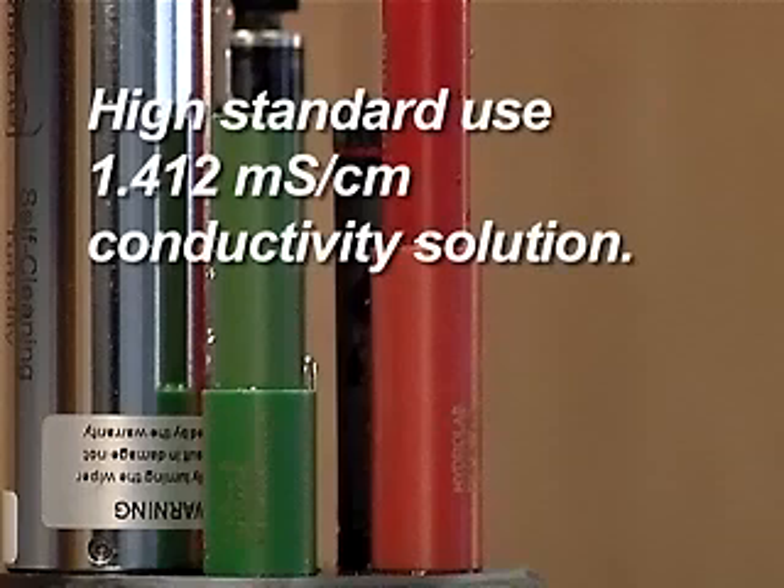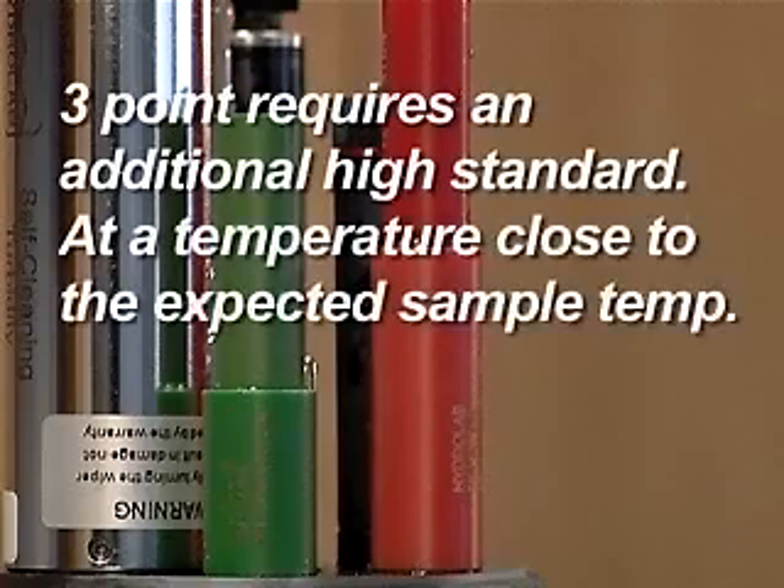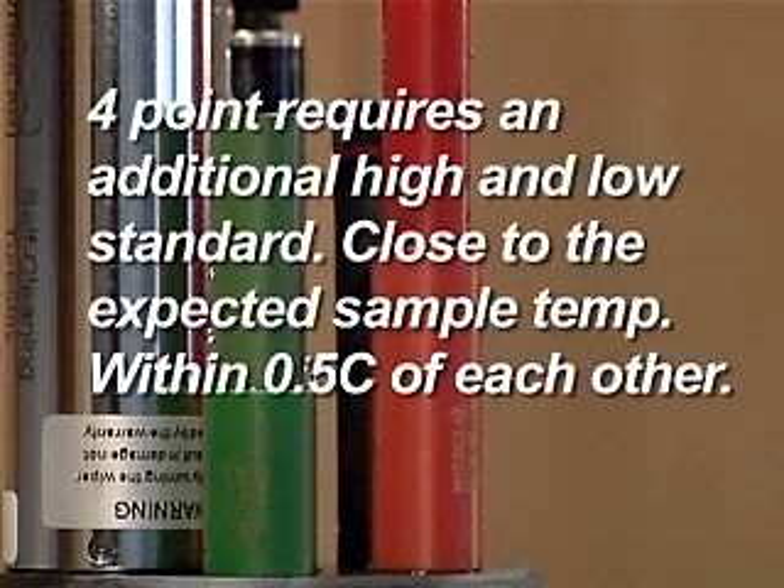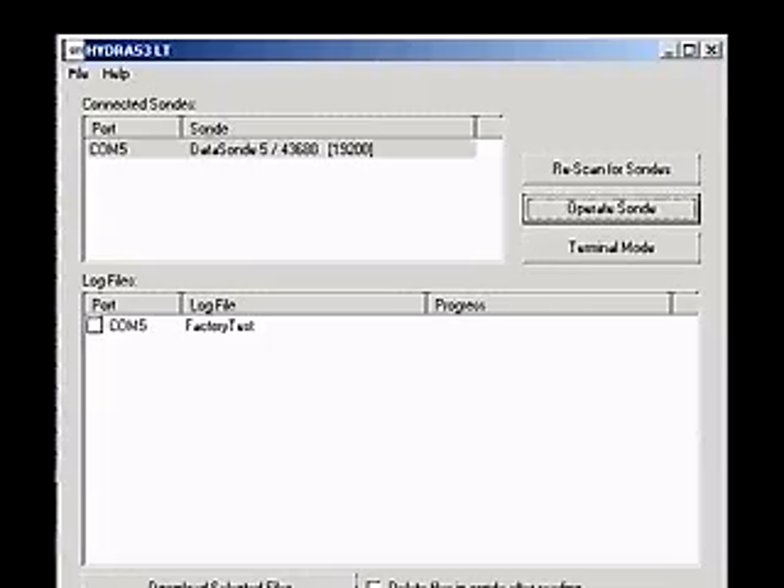For the high standard, use a 1.412 millisiemens per centimeter conductivity solution. A three-point calibration requires an additional high standard at a temperature close to the expected sample temperature. A four-point calibration requires an additional high and low standard close to the expected sample temperature and within 0.5 degrees centigrade of each other.